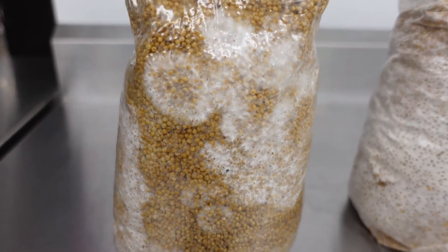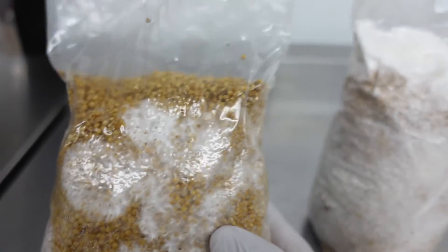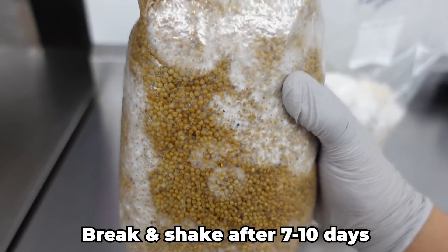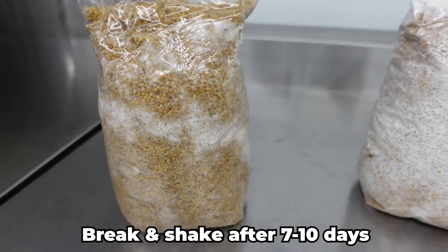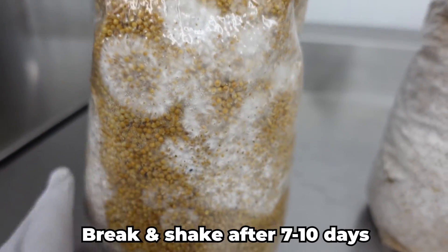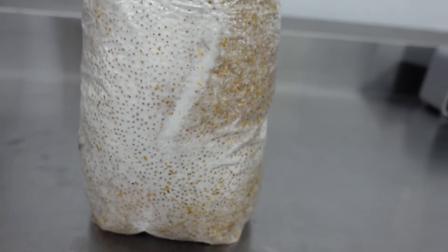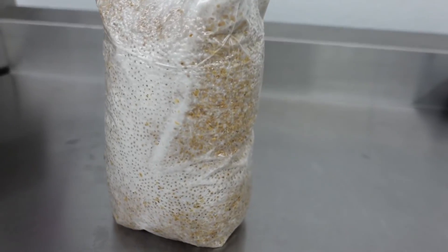Now seal them with a bag sealer or tape and set them in a dark room or closet to incubate. After about 7 to 10 days, you should see some growth. At this point, you'll want to check for contamination and break up the established mycelium. Shake up the bag to evenly distribute the mycelium — this will help it rapidly and evenly colonize the grain. Now leave the grain undisturbed until it is fully colonized and white with mycelium. At this point, your colonized grain spawn is ready to use.